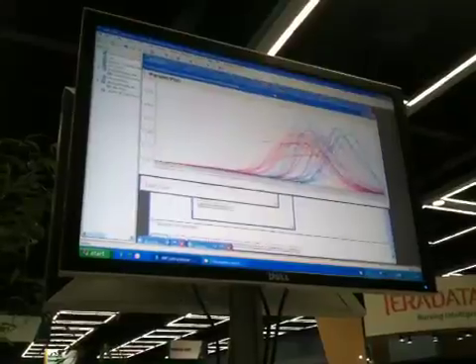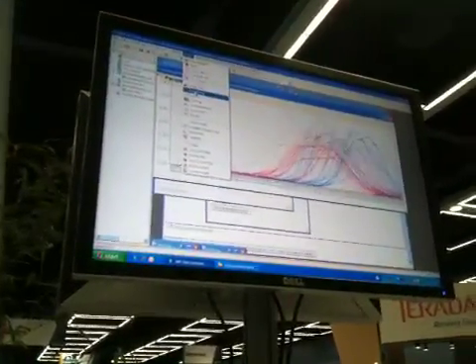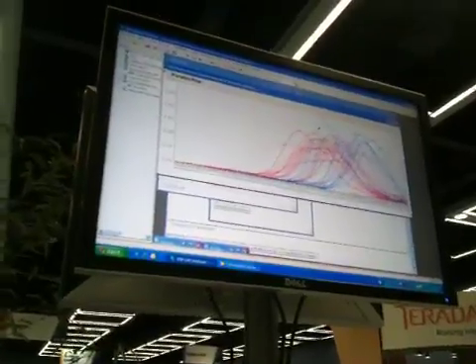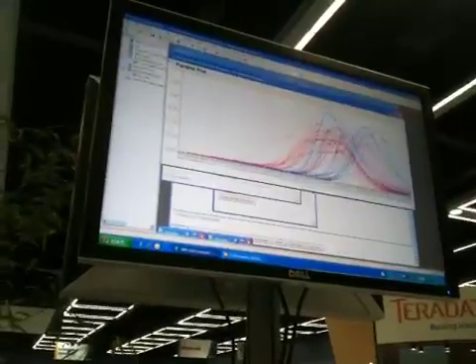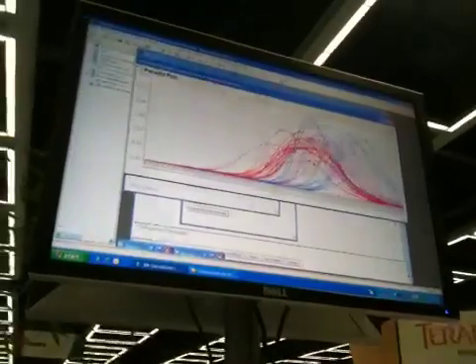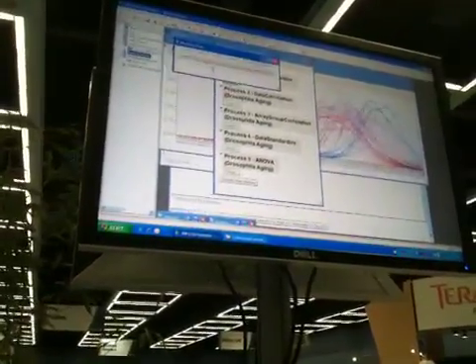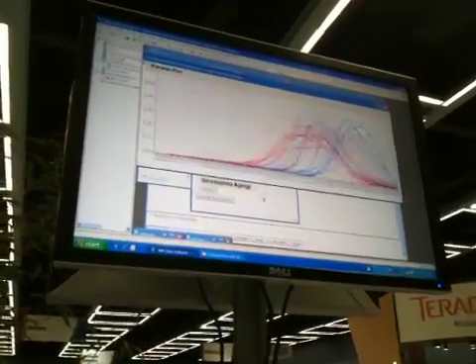So we're taking advantage of the parallel plot platform that's available in JMP through the graph menu as parallel plot to plot the distribution of the gene expression intensities for each sample from our experimental design set. And we've colored by sex, which seems to be a very good differentiator between the two groups. Notice the interactivity of these graphs. You can do selection, and we have drill down possibilities for things where you can actually remove bad quality arrays from your data before you continue on.